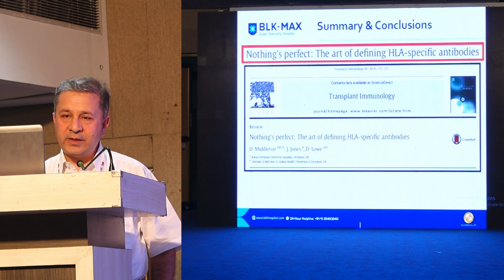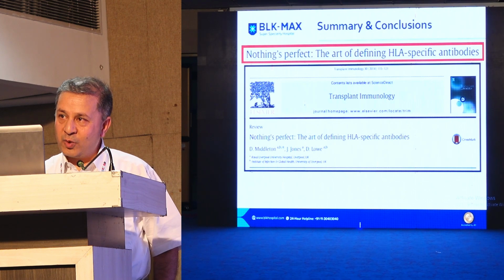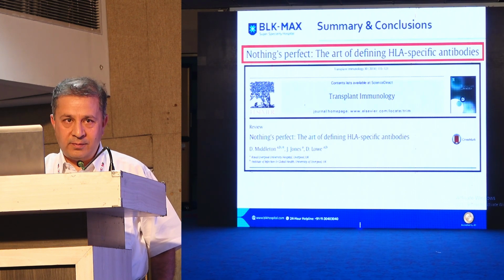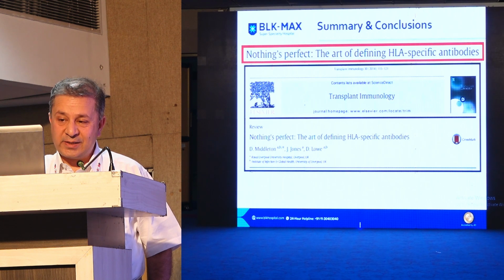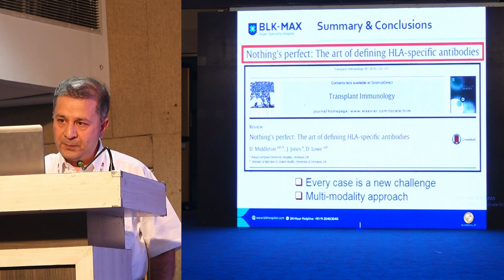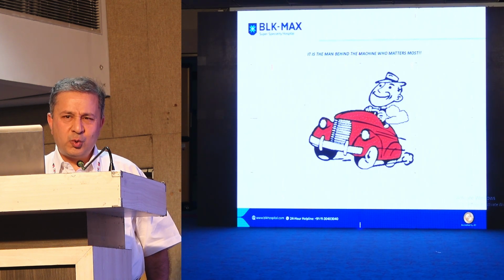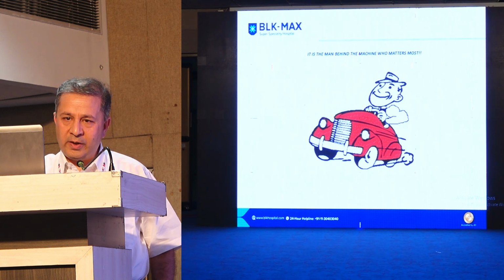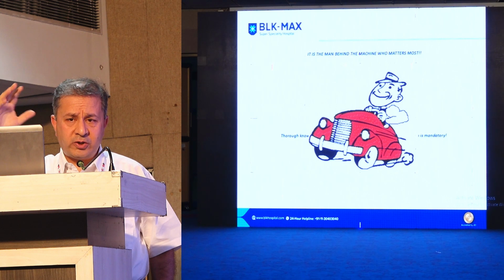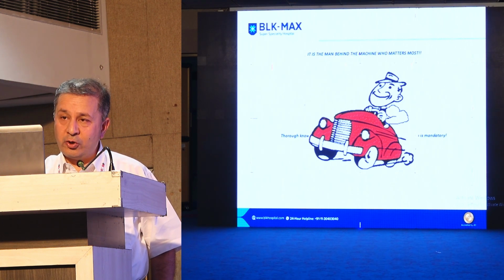Finally, nothing is perfect. If you can do all the tests, please do all the tests. But if you can't, at least go and follow an algorithm. And because every case is different, it's a new challenge, and a multimodality approach is the best way to follow. And remember, it's the man behind the machine who's most important. Who is doing your test? Who is seeing it properly? Who is interpreting the test? Does he have adequate training? Does he have the thorough knowledge of the background? All that is equally important for you to realize what you're getting on your plate.